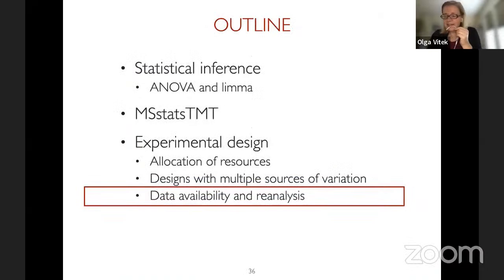Okay, so as I said, it was somewhat technical, but I'm happy to clarify, and I'm sure Ting can also clarify a lot of things here. So very last thing, and this is something that we would like to share with you, and tomorrow there will be even more discussion on this topic, but I would like to give a preview already, is how can we benefit from the data which have been collected previously and analyzed previously.